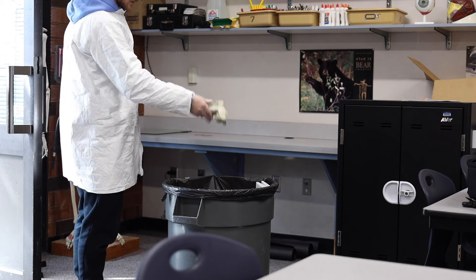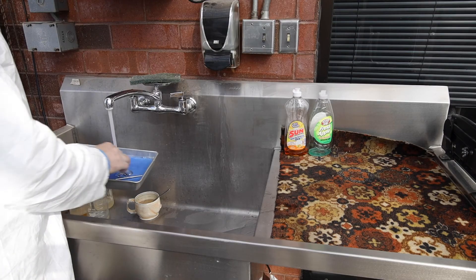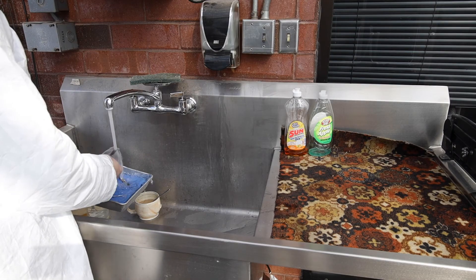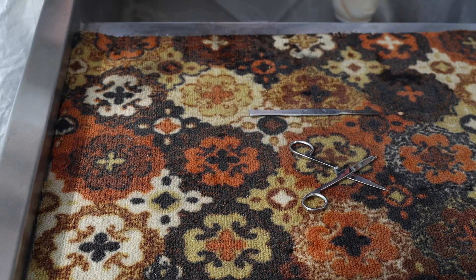The third and final step to ensure a safe and fun dissection is the cleanup at the end. Once you've identified all the structures and had a great time with your dissection specimen, carefully take your dissection tray and dispose of all dissection materials as directed by your instructor. Many things are not allowed to go down a common sink. The dissection tools are now filled with chemicals and animal tissue — rinse them under water, lay them out flat on a paper towel, and leave scissors in the open position to ensure that rust does not form, so these tools can be used for many more dissections to come.